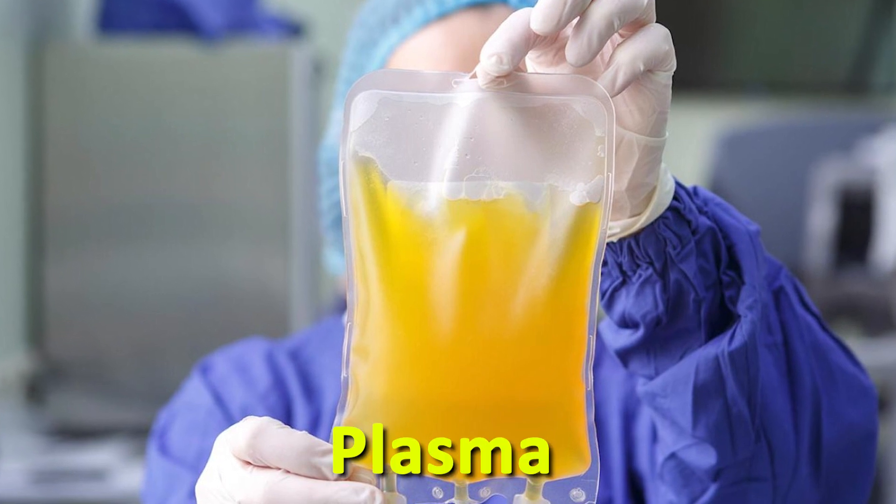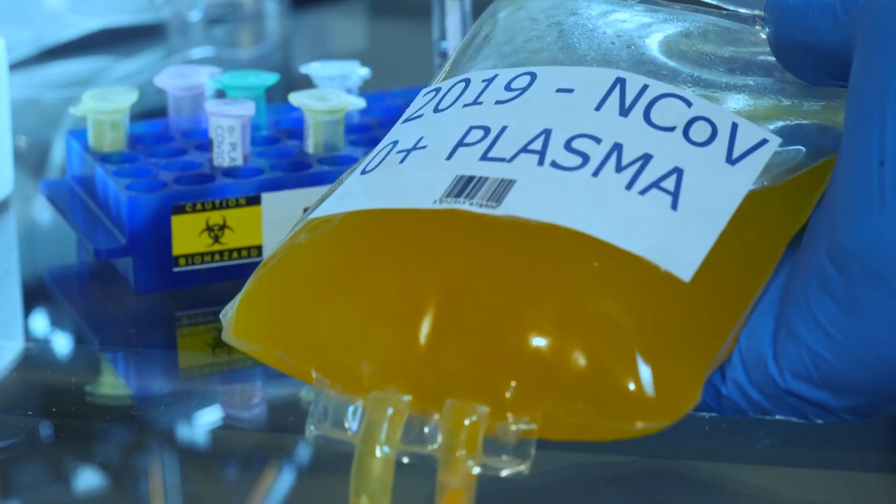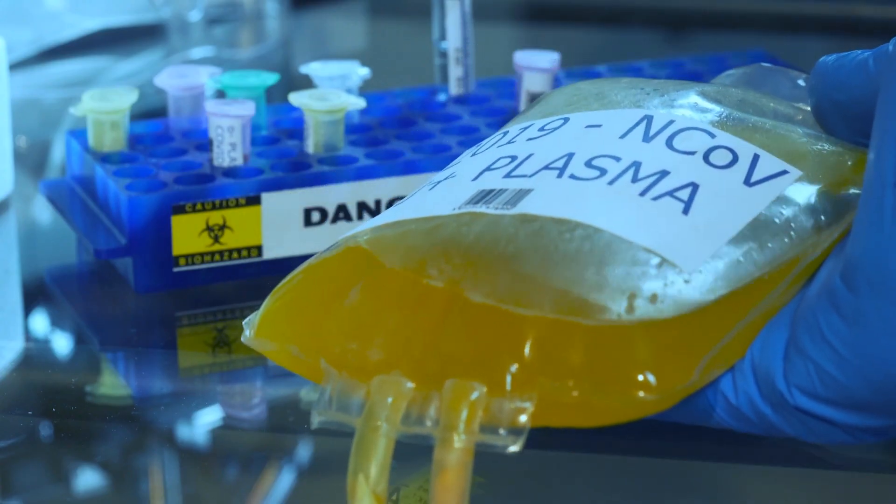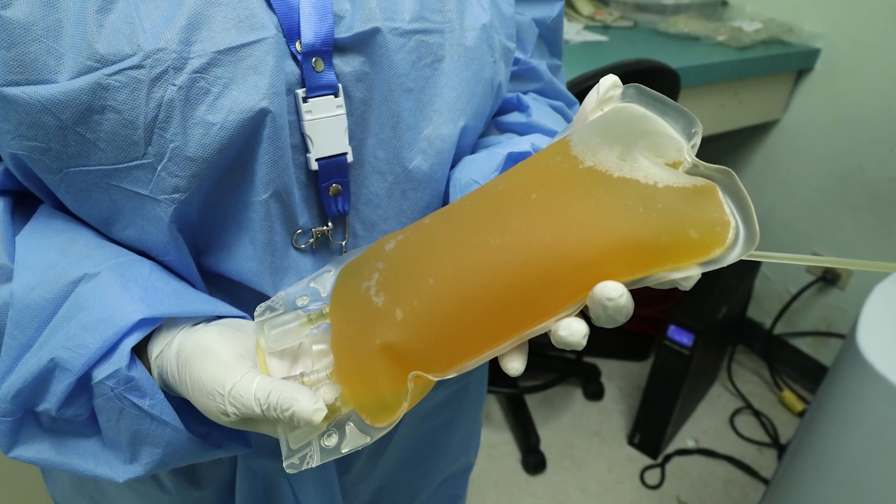And the liquid part is plasma. When plasma is separated from the rest of the blood, it looks like a light yellow liquid.